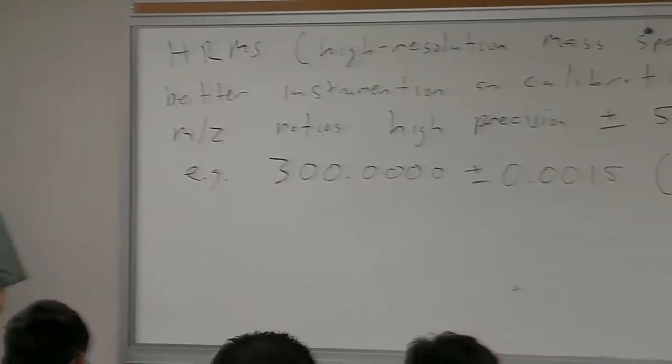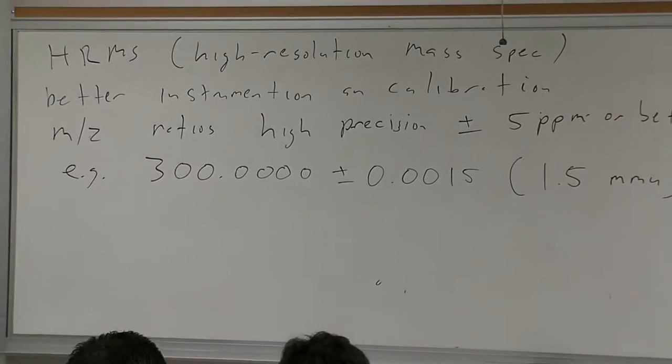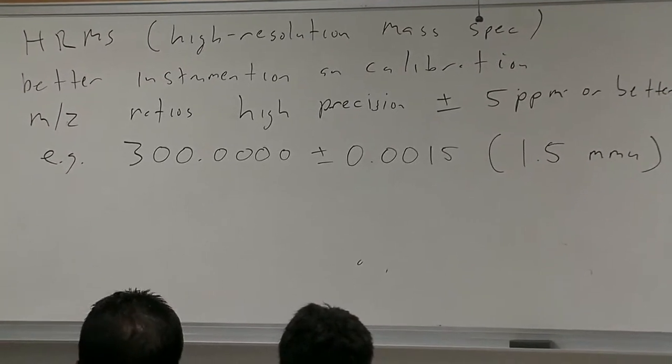And in this particular case, you can start to distinguish among different species that have nominally, in other words, to the unit mass, the same mass.